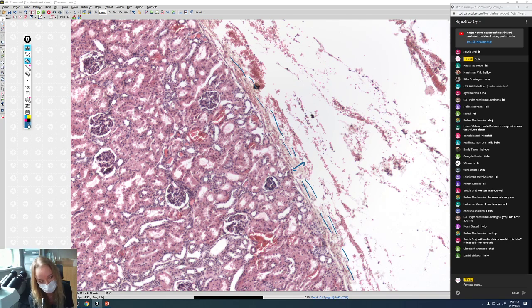Right above the capsule, which is made of dense connective tissue, there will be some adipocytes and loose connective tissue around here. So that will be the adipose capsule. But you cannot really see that right now. There are just some erythrocytes, and that is due to preparation of this slide. So this is just artifact, I guess. But you can see pretty well the capsule of the kidney. So once again, dense irregular connective tissue about the kidney.